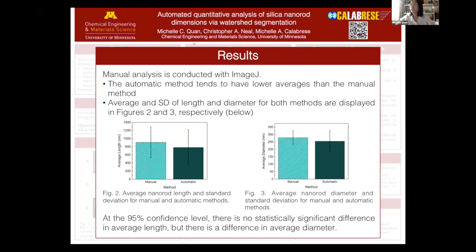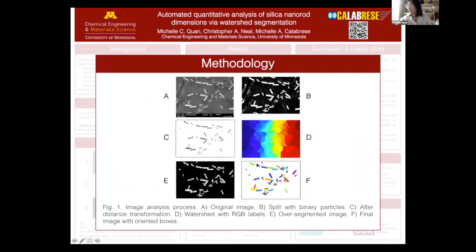Yeah, so in the paper I addressed this, but within this sample it's a little bit harder to tell, but for some of the particles like this, they have a varying width with a wider part and tapering in at the point, which is a more irregular shape. But because of this, the nanorod may not lay completely parallel to the box and may run at a diagonal.